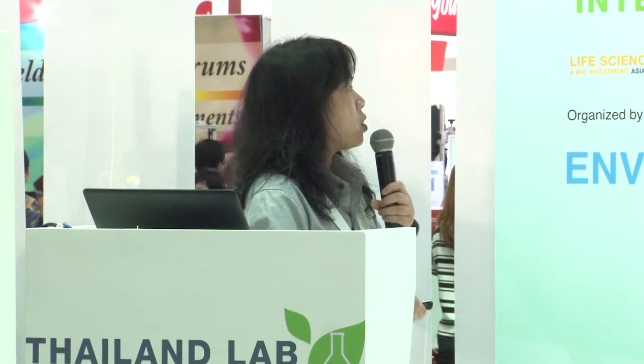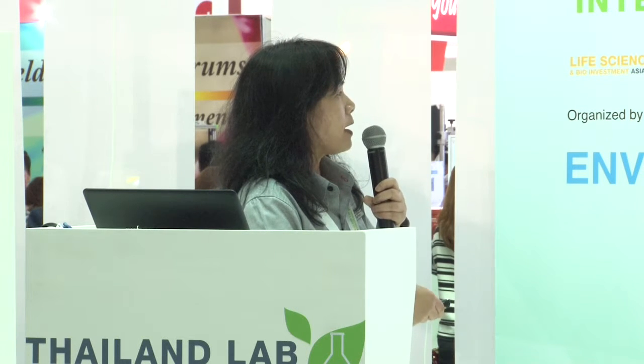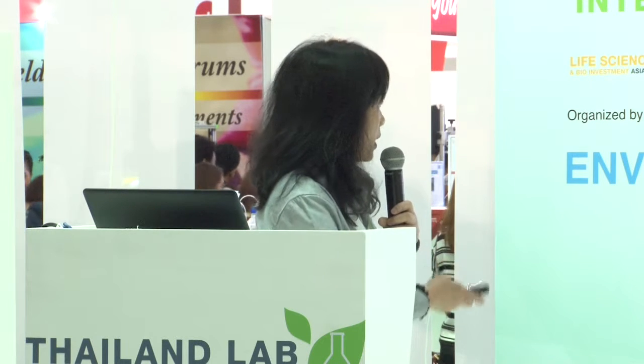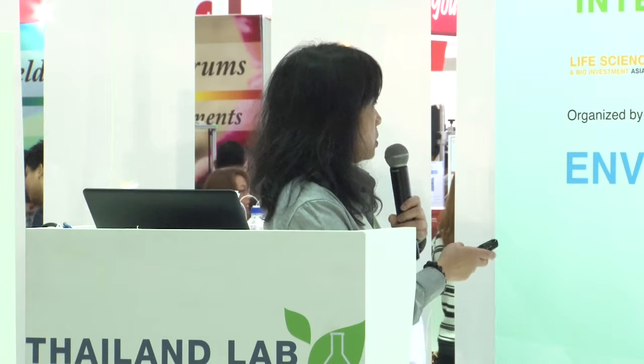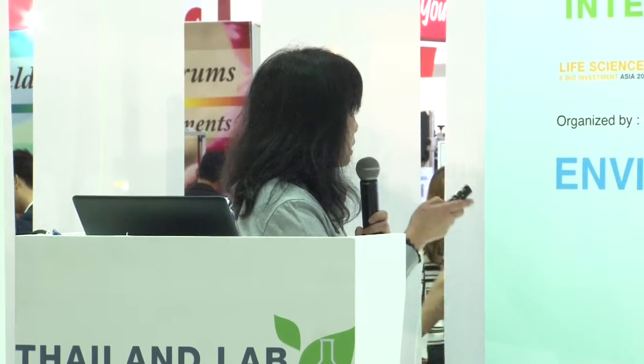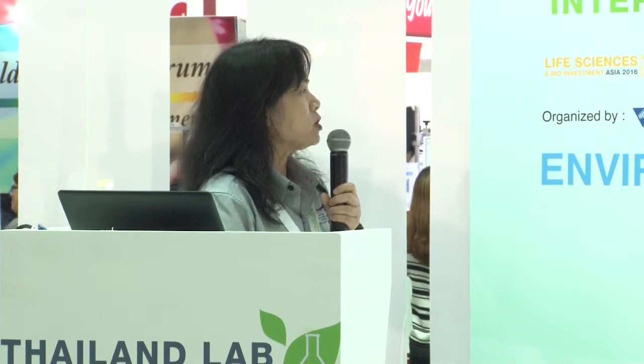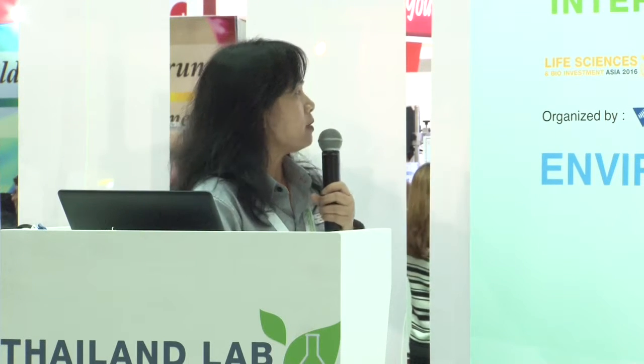Okay? So to do this, we use so-called collision reaction cells, right? So in a very, very small confined area, we pump in helium as a collision gas or hydrogen as a reaction gas. Right. Okay, so this is an example. I click everything up here, alright. So arsenic 75 could be interfered by argon 40 and chlorine 35, right?